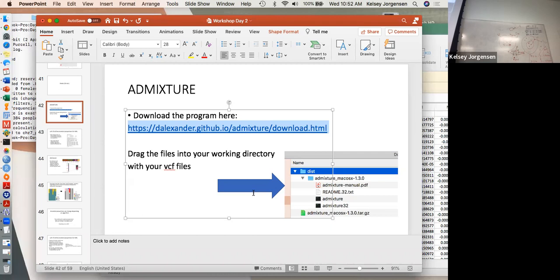Strange. I think we have to figure out why your R is defaulting to that, because it should detect the axes and then adjust it. Well, it's because there's one outlier data point, so it's forcing the axis to do this, but if you could force the axis to be 0.07, then it should plot normally. But we should all have the same data. Yeah, so somewhere in Excel we could hit a button. Oh, maybe we deleted a decimal point somewhere, I guess. I'm guessing a decimal point got deleted.